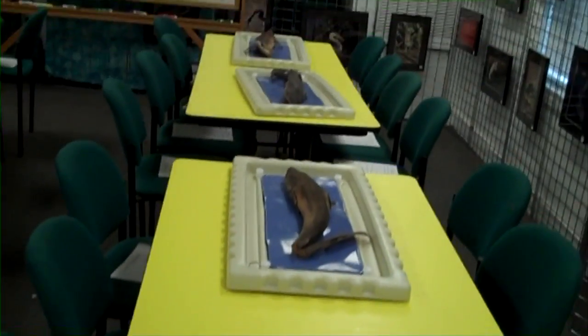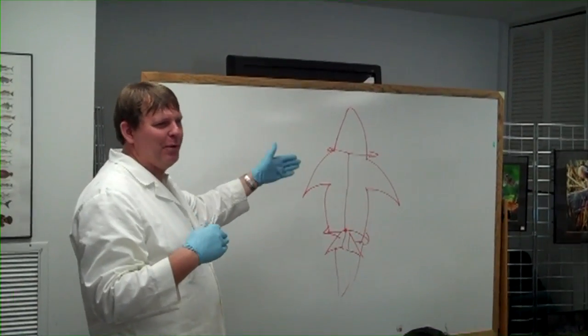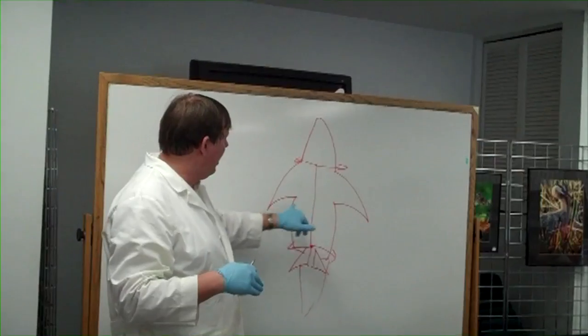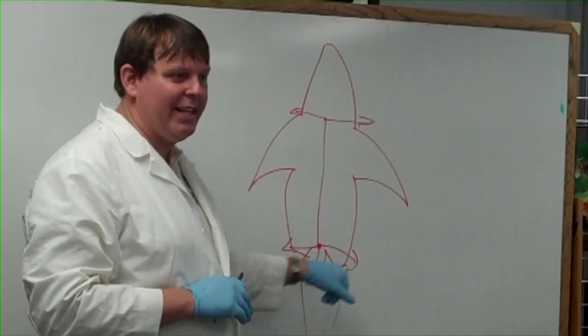Today we're going to be dissecting sharks. This is my interpretation of the shark. This is the head. The pectoral fins, the pelvic fins are down here. This is the body — this is where all the fun stuff is.